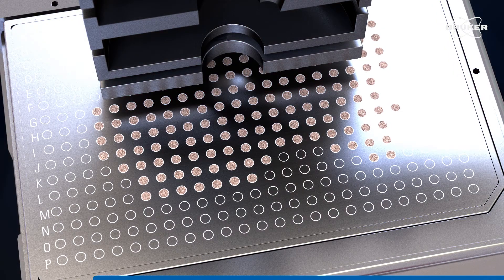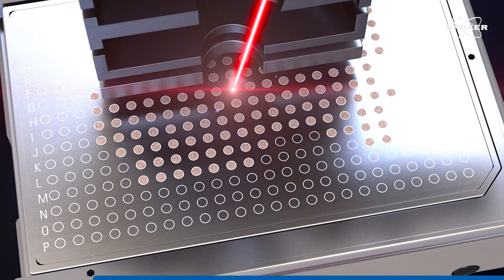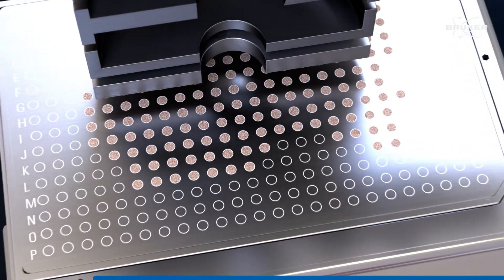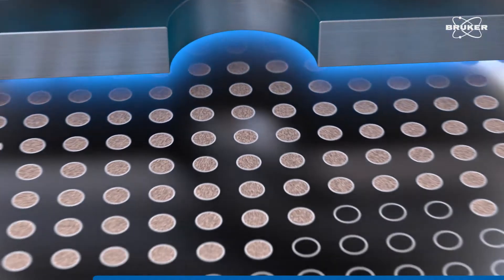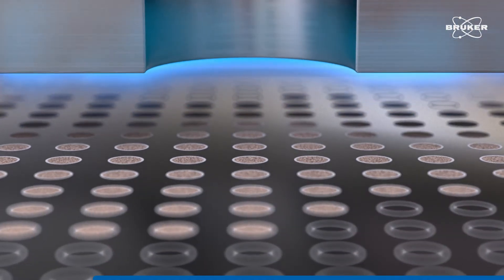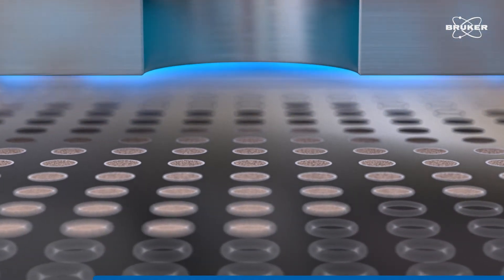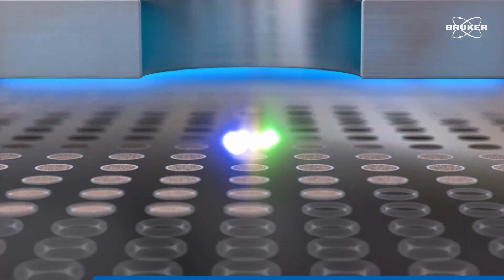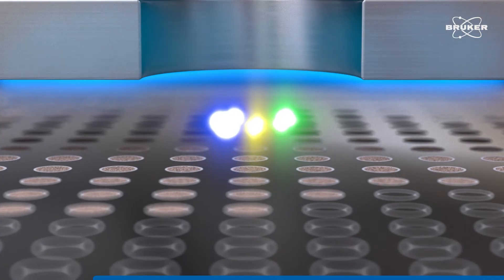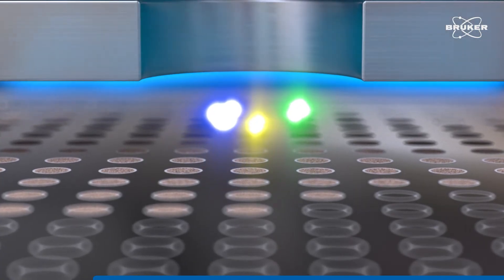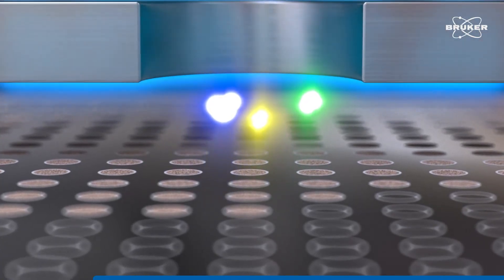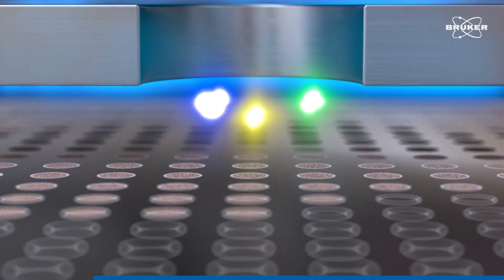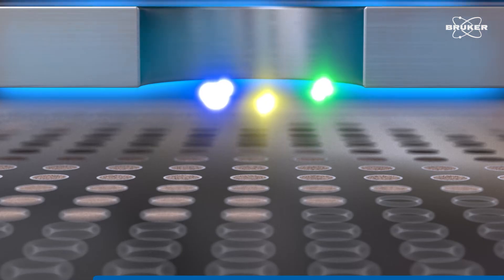Samples are co-crystallized with a suitable matrix on a sample carrier. The samples are vaporized by the laser into a vacuum while being ionized at the same time. During this process, the sample molecules can become excited.